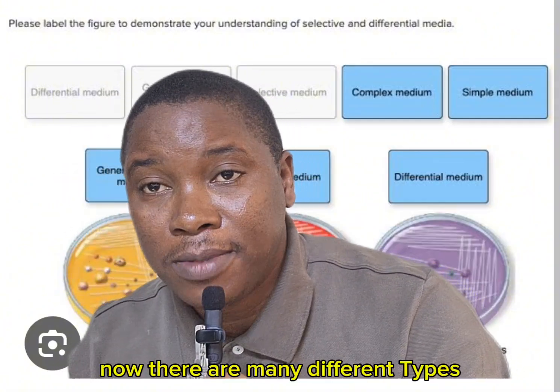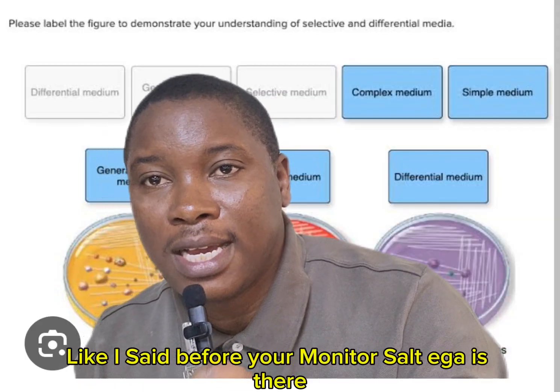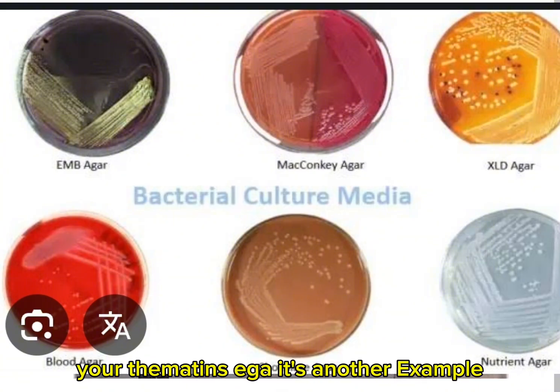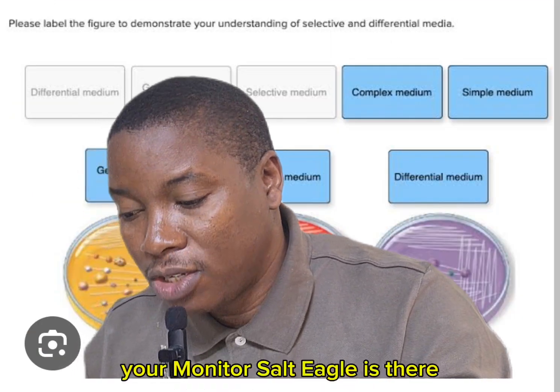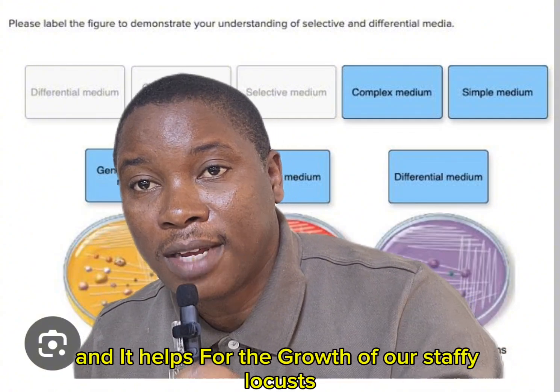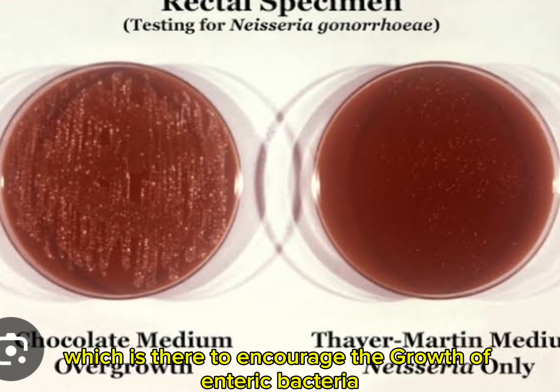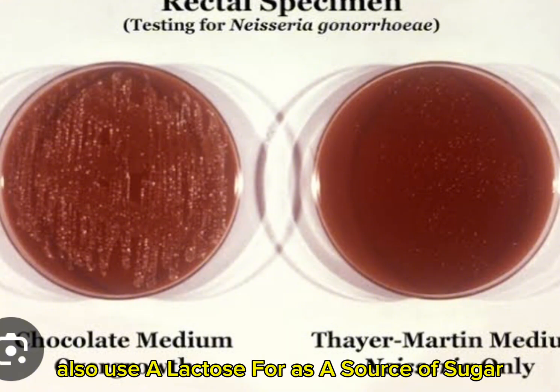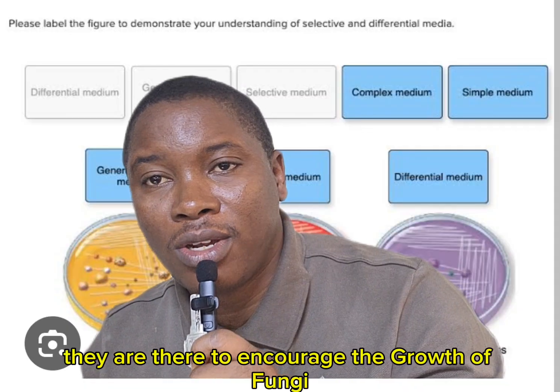Now, there are many different types of selective media, but we'll just mention a few of them. Like I said before, your mannitol salt agar is there, your MacConkey agar is there, your Sabouraud dextrose agar is there, your Thayer-Martin agar is another example. So they are all different types of selective media. Your mannitol salt agar helps for the growth of our Staphylococcus. We also have our MacConkey agar, which is there to encourage the growth of enteric bacteria. Many of these enteric bacteria also use lactose as a source of sugar. You have your Sabouraud agar, your potato dextrose agar. They are there to encourage the growth of fungi.